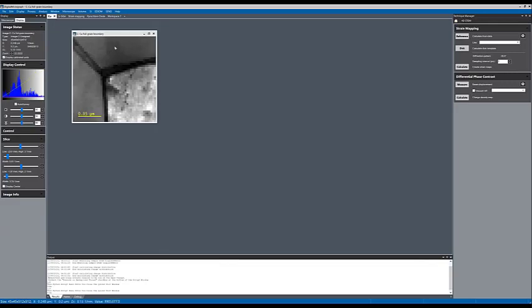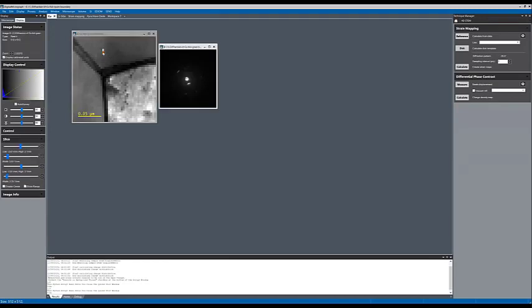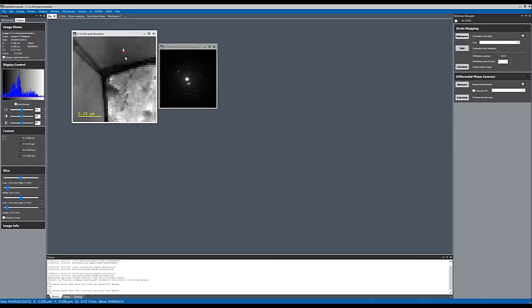The first thing I'm going to show you, which you also saw Roberto use quite a lot, is a picker tool here, the spectrum imaging picker tool. If you have used EELS, you are very familiar with this picker tool. You select the picker tool, put it on your 4D STEM data set, and immediately it gives you a diffraction pattern from the pixel selected by the picker tool.